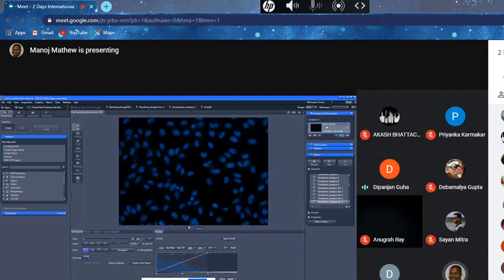Any questions? I think there is a participant, Saurabh Ghosh and Niranjan Ghoshal. They have written something for you in the chat box. So I'm just reading it out. If I am looking for any protein foci within cells by immunofluorescence, is the software able to count the number of foci? Can it distinguish between two overlapped foci or closely pointed foci?